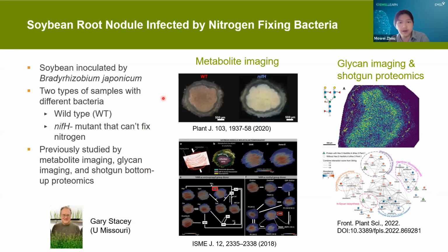For a little bit of background on these samples, this is in close collaboration with Professor Gary Stacey at the University of Missouri, who has been very generous in providing us very great samples for those soybean nodule studies. A lot of my colleagues have been working with him as well in the past few years. I know there are several publications focusing on metabolite imaging. And recently, we've done some plant glycan imaging and shotgun bottom-up proteomics.